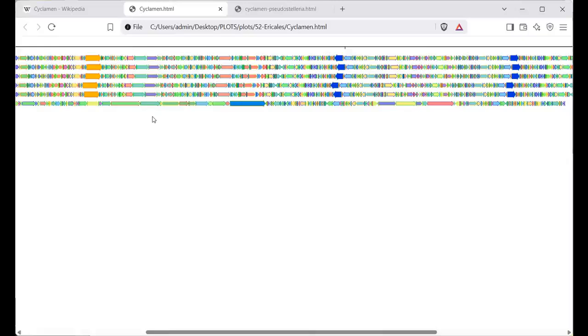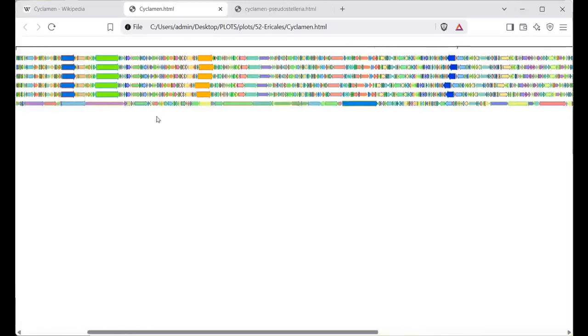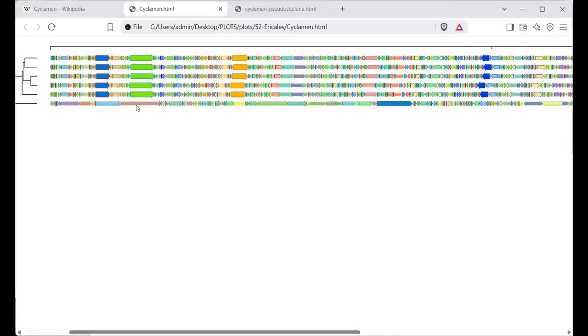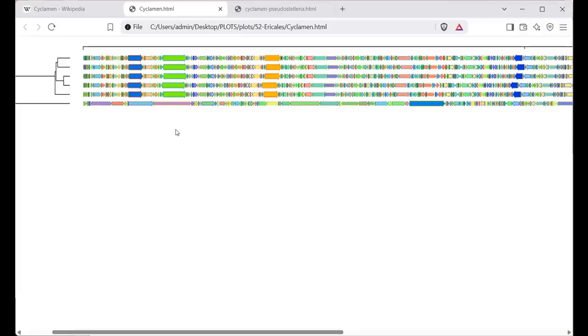I made a list of 35 or 36 cases where one, or in one case two, sequences did not match the rest. The rest were all very similar. One sequence stood out. And in each case, I did this whole analysis.